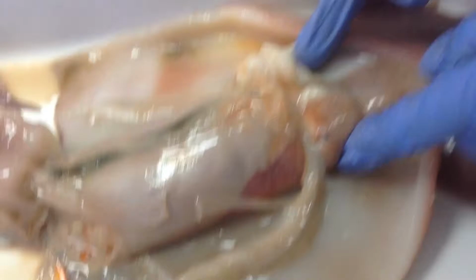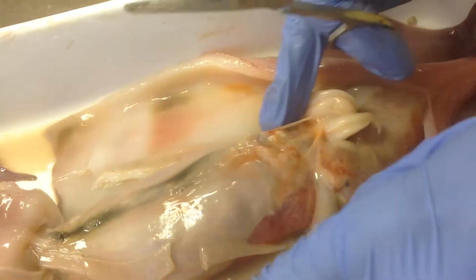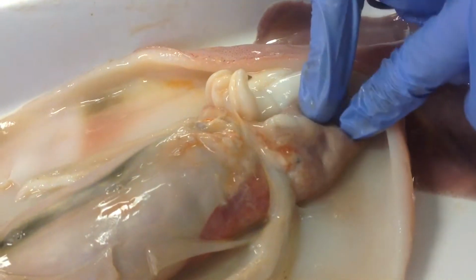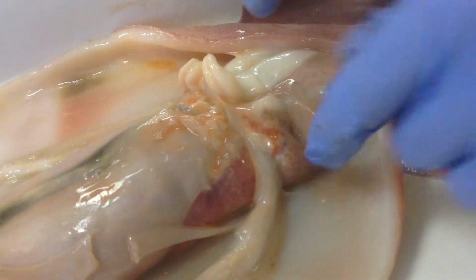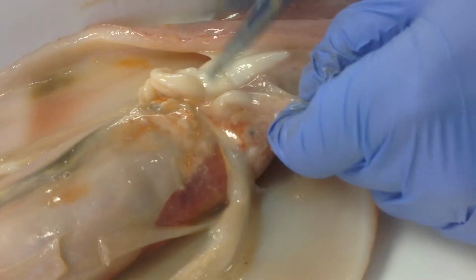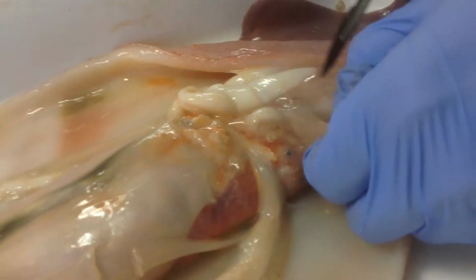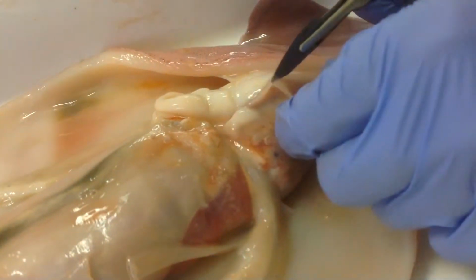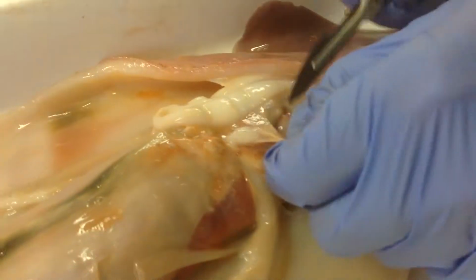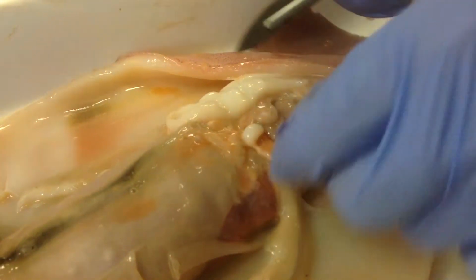No sign of the lungs, but whatever's covered in this film here, I'm assuming these two are the lungs. We have a gill coming from this side and a gill coming from this side. This appears to have some sort of contracting function. It's almost cemented to the film, so I'm going to see if I can puncture it. Here, you have a scalpel, and we'll see if there's a sharp end of the scissors you can use. If those are some form of lungs, why are they placed that way? The rest of this creature seems to be mostly symmetrical. They are quite symmetrical, actually.